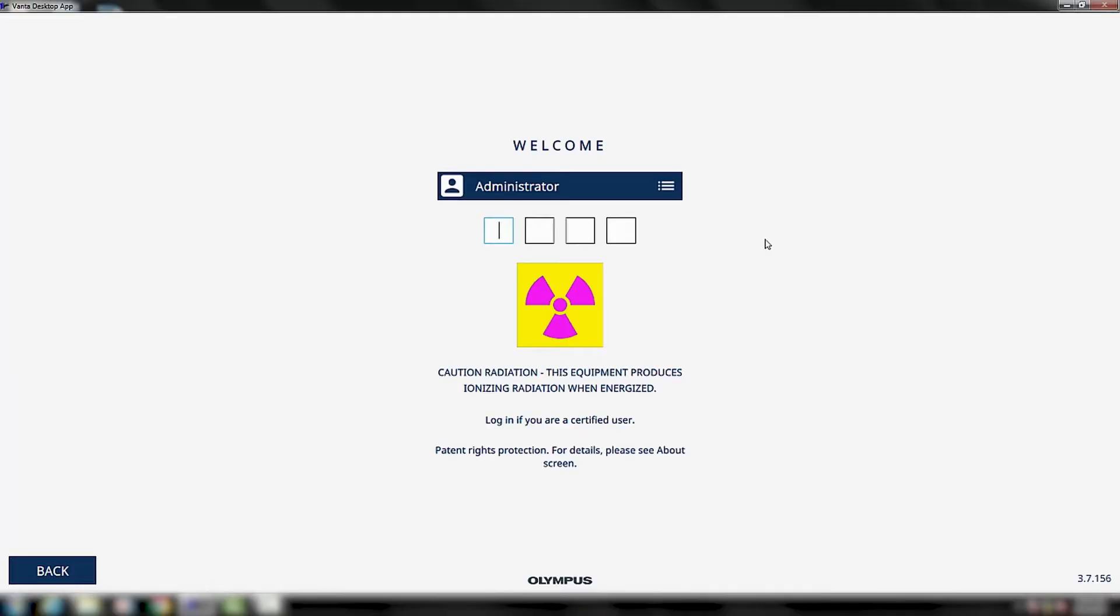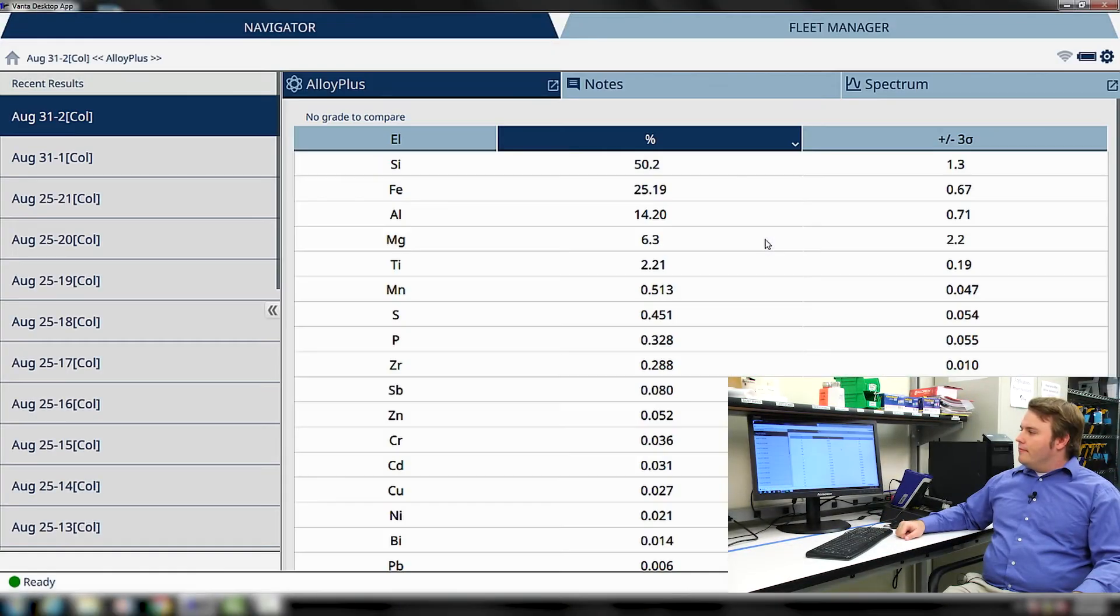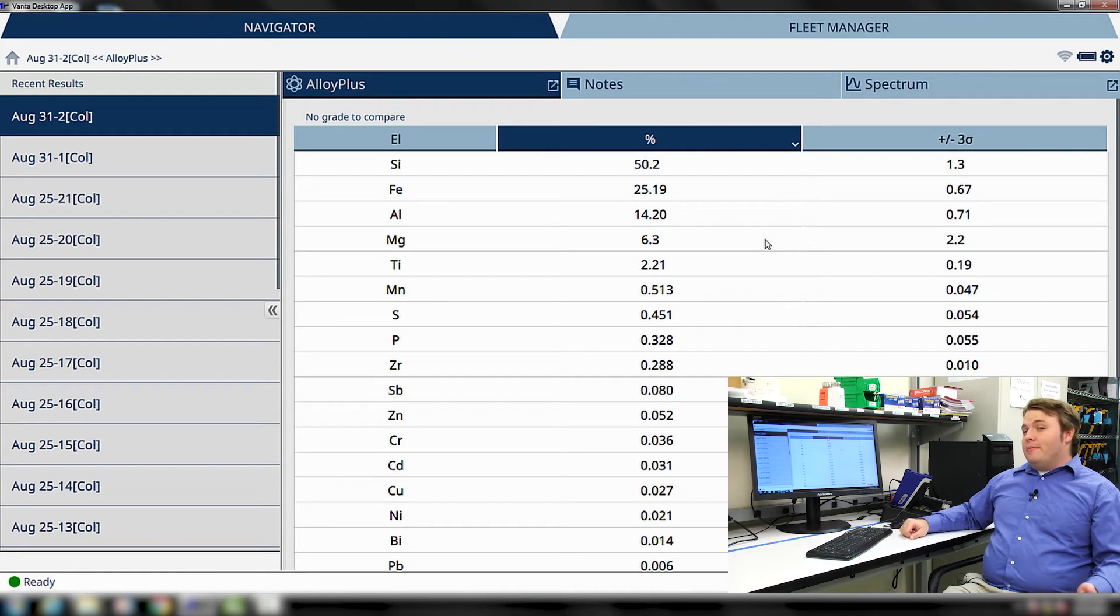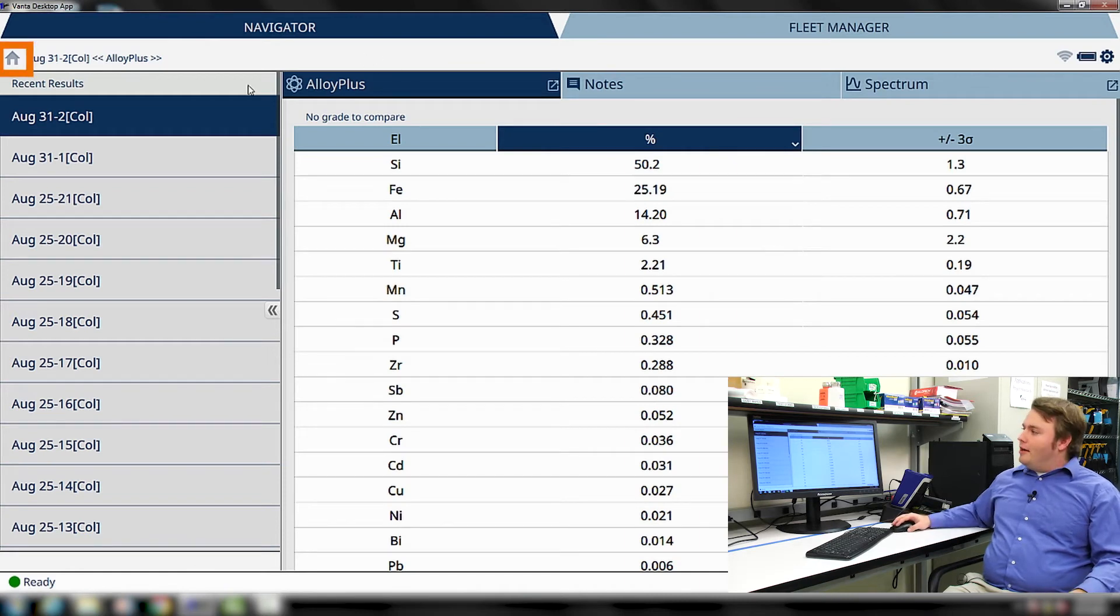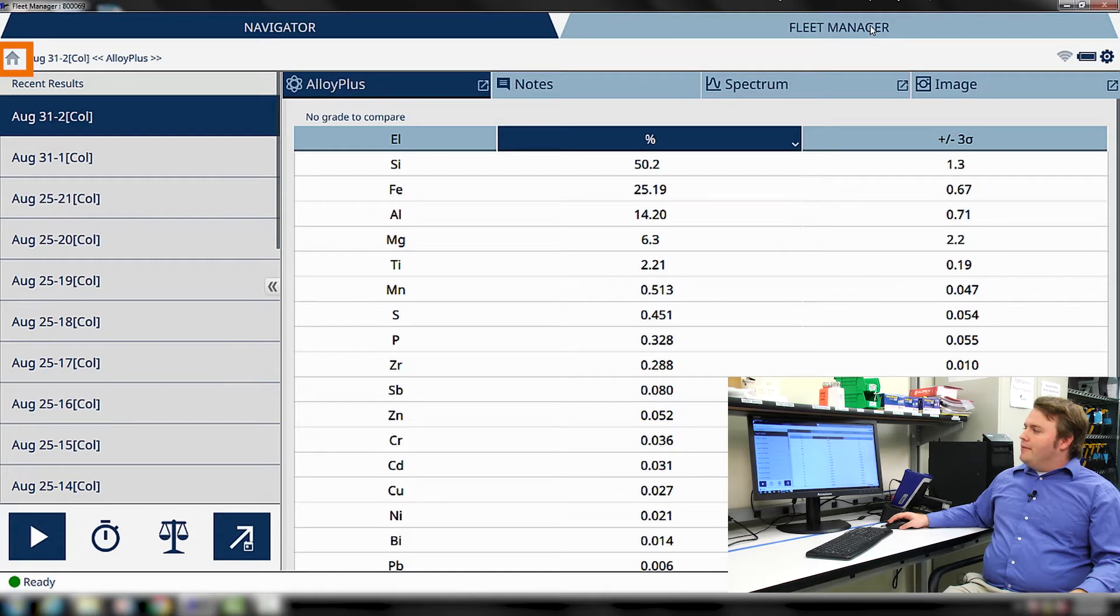Hi there. My name is Dylan McDowell, and I'm here to show you how to create a new user profile using Vanta Fleet Manager. We access Fleet Manager by logging into the Vanta PC software using the administrator login. We can access Fleet Manager by pressing the home icon in the top left-hand corner and selecting the option for Fleet Manager.